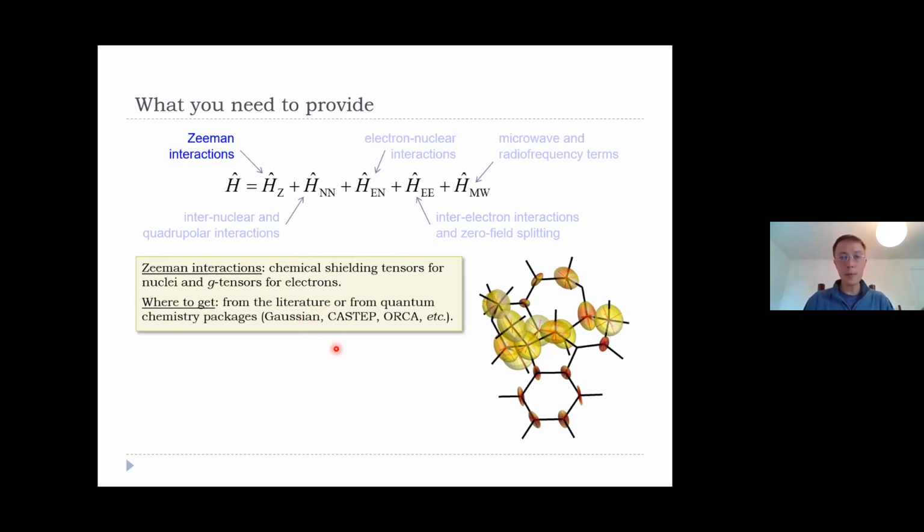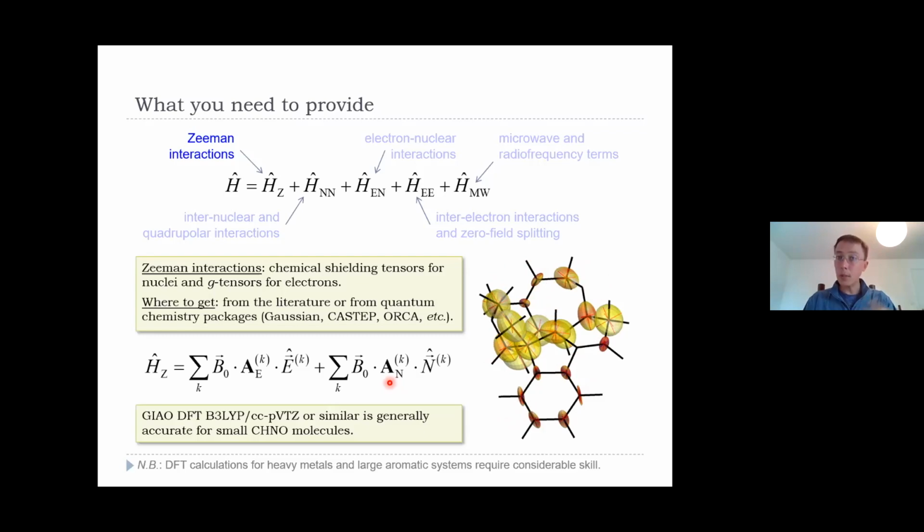Talk to your quantum chemists, they will do that to you and for you. And then that's an example. These are chemical shielding tensors in strychnine, I think. So you can see carbon atoms are shielded slightly anisotropically, more anisotropically in aromatic systems. But these are ellipsoids, just different directions in space. They're shielded differently. And SPINACH will tell you, the documentation will tell you, and I will tell you in a few slides how to supply that information.